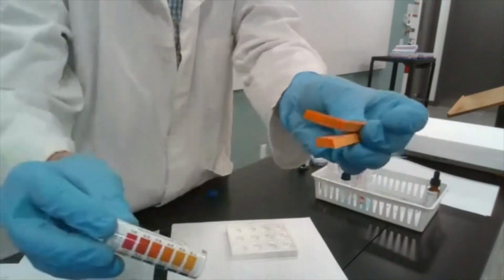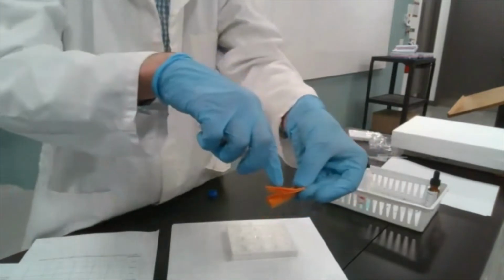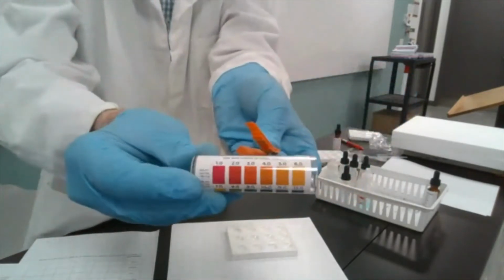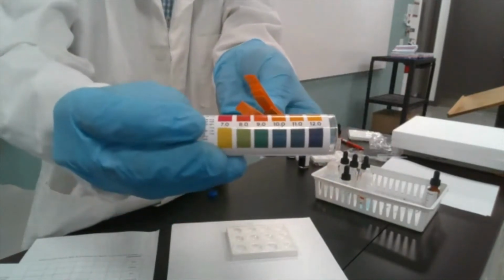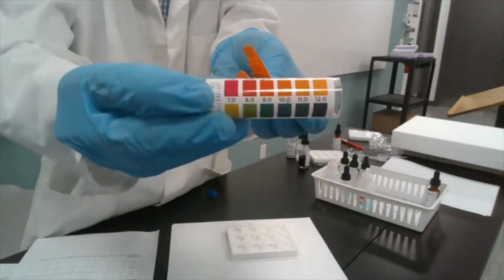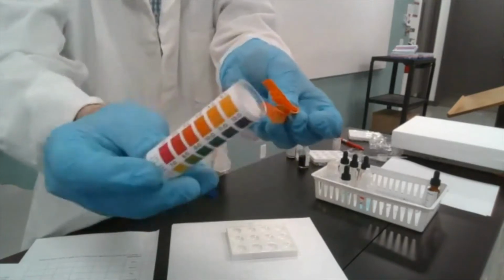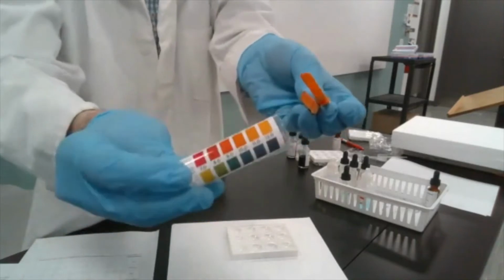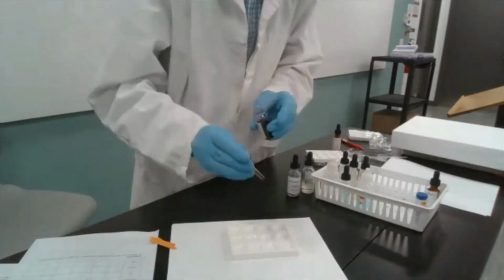The way this works, you dip the strip into your solution, or you apply a drop of the solution on the strip, and then you quickly compare the resulting color and read off the pH value of that solution off this scale that's printed on the vial or jar. And that's how it works. It's really convenient because you can tell right away what the pH of your solution is. So this blue litmus.